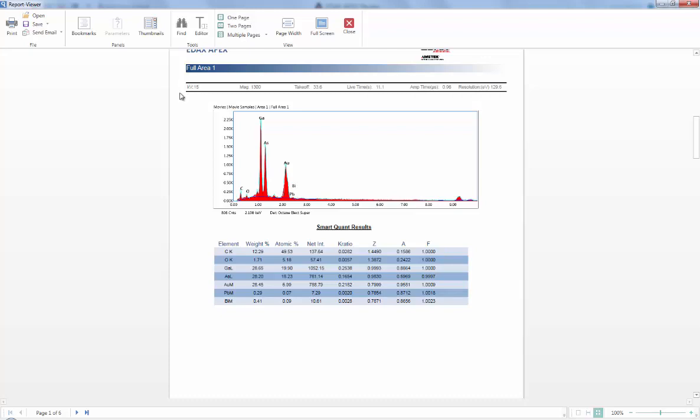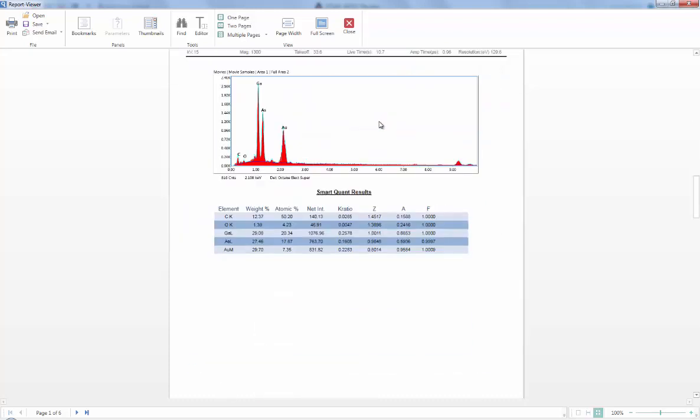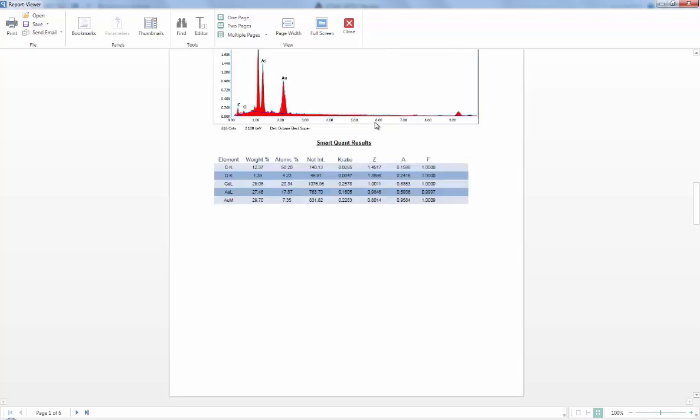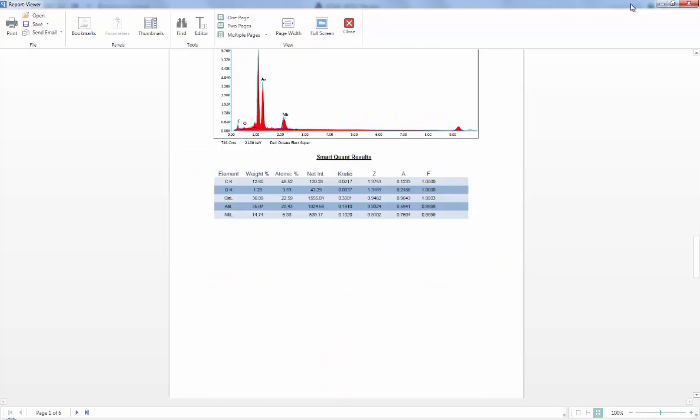And all my collection material is going to be up here. So this is collected at 15 kV, 1300 magnification, etc. So all this information is always there with the data.